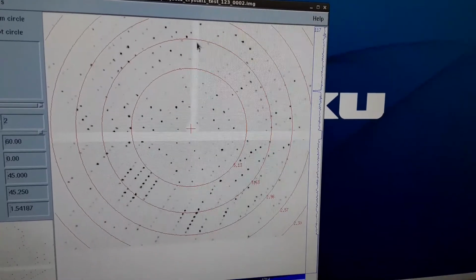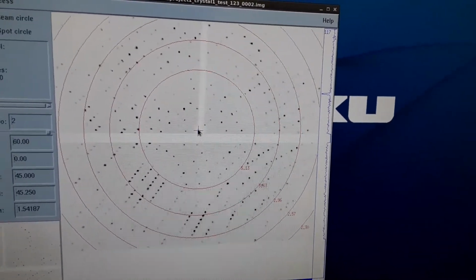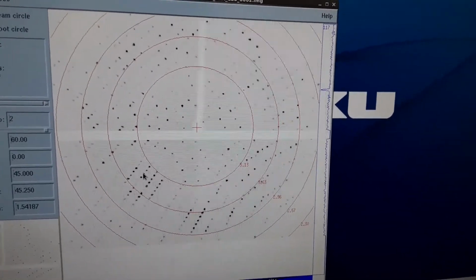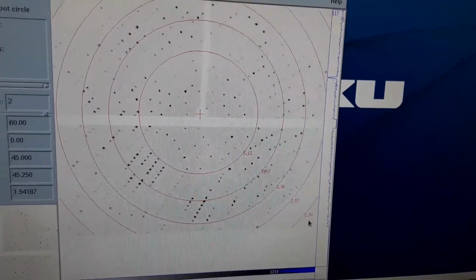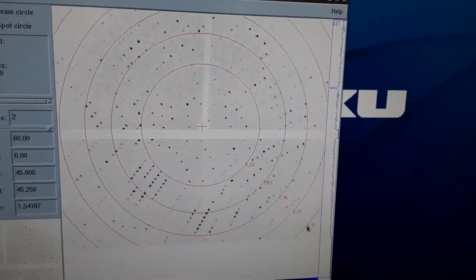And the software knows about that space, and that's just fine. Then this vertical white bar here, that's the shadow of the beam stop, where the direct beam is right here. You can see individual spots of reflections, and then the red rings are different amounts of resolution out to 2.3 angstroms on this setting.